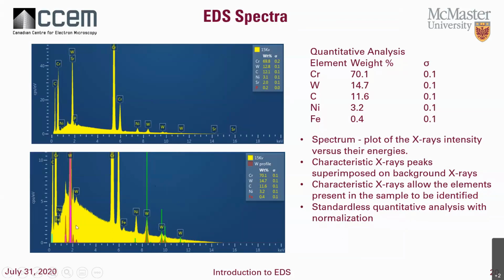And you can see here that we have a profile for the tungsten peaks, their position, and also their relative height that normally exists. Sometimes the relative height will be affected if we're looking at single crystal materials. So that's something you have to be careful of sometimes.